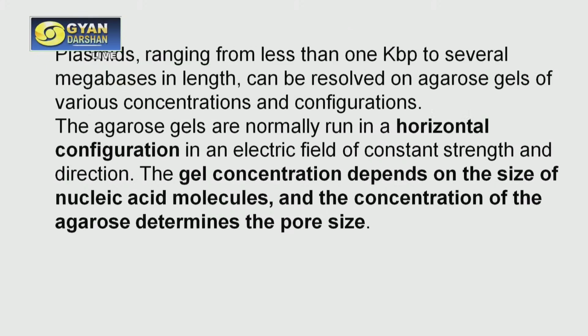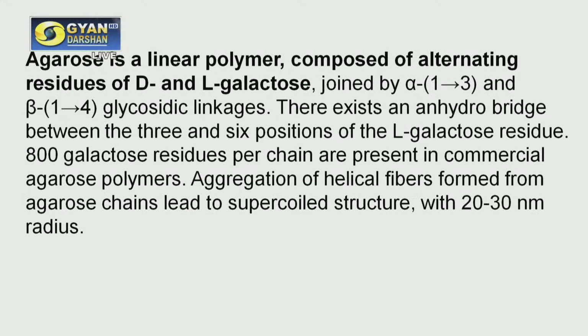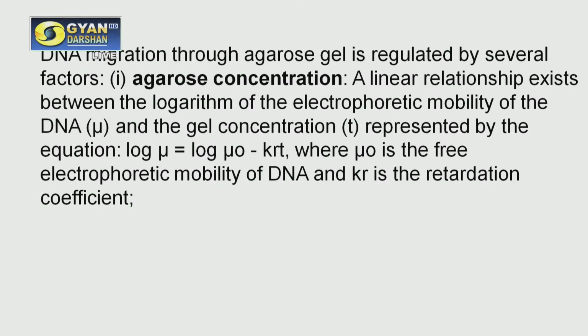So there are different factors which determine the mobility of DNA in an agarose gel. Number one is the agarose concentration. That is, if you use a high agarose concentration, then the migration will be slower. If you use a lower agarose concentration, migration will be faster.